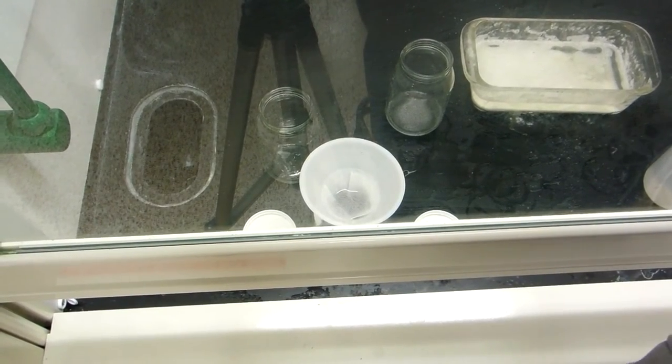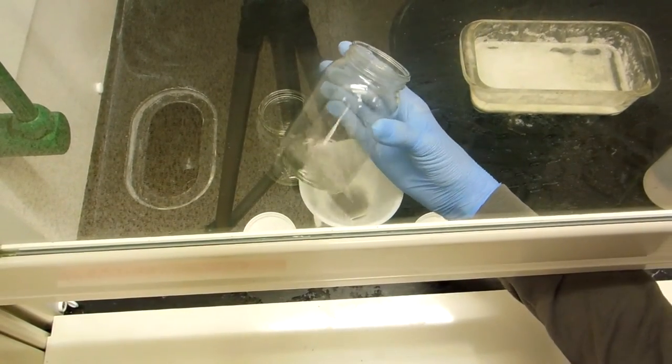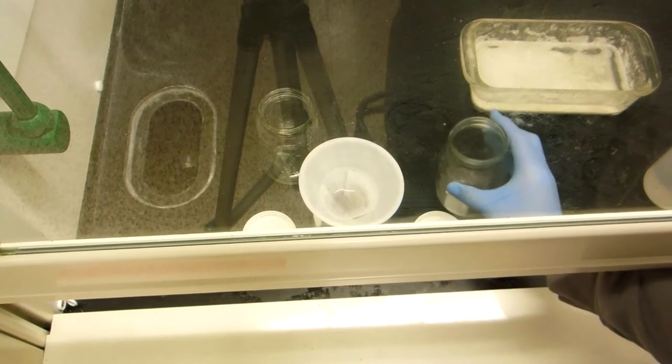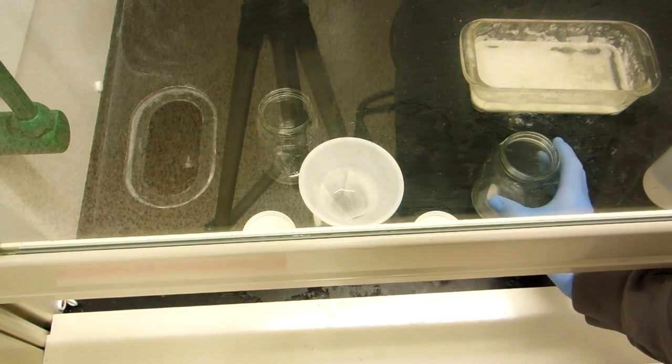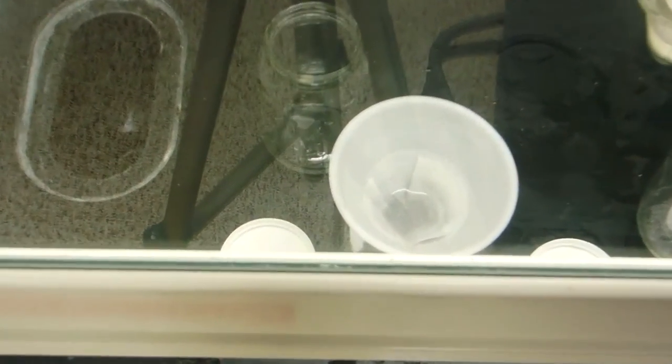So now I will transfer the rest of the liquids with the solids into the jar. As you can see, the solids are present in the funnel with clear solution on top. It blurs out a lot, but for a while you could definitely see the solids. So I've dumped the rest of the solution inside the funnel.